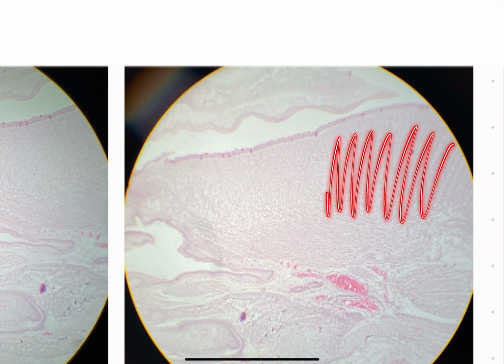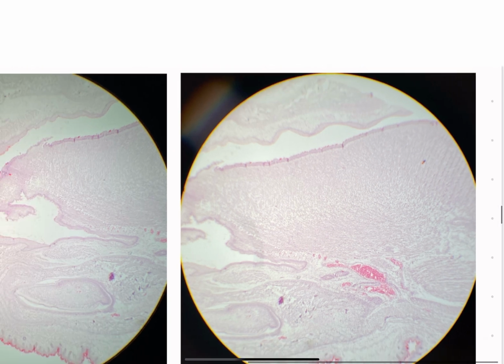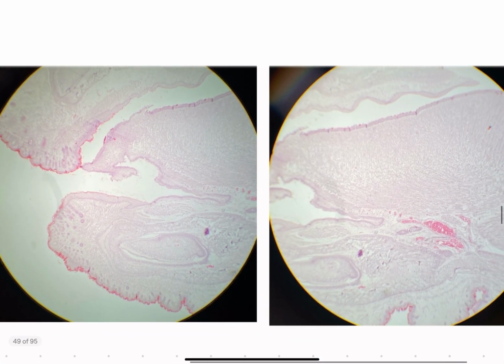And in the tongue we have these striated skeletal muscle fibers, which is definitely something that might come up in the colloquium as a question that they ask you. They can also ask you about the blood vessels, just casual, very simple structures to try to throw you off. The oral epithelium, not as casual of a structure, but still something that could be asked. The same thing as that oral epithelium underneath the tongue. They can ask you about the tongue papilla. They can ask you about the nerve fibers that you can often find around the tongue here.